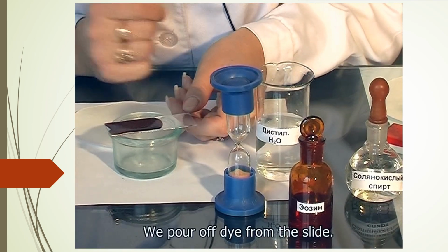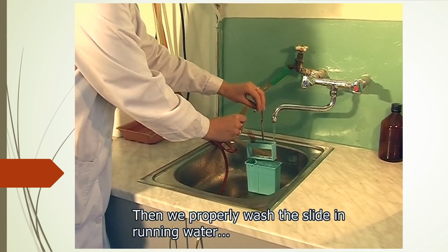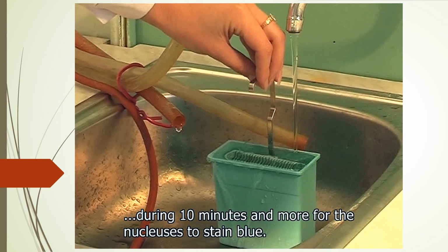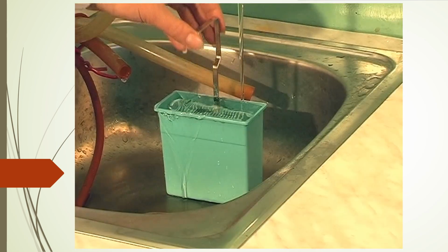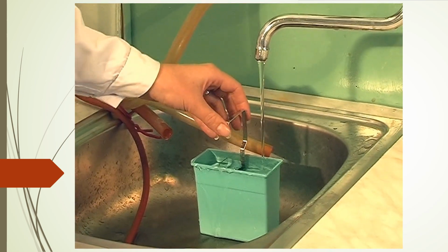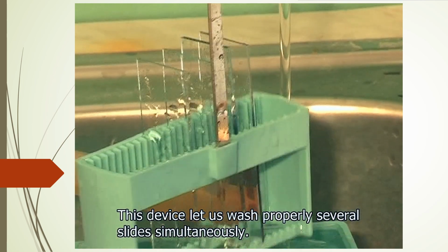We pour off dye from the slide. Then we properly wash the slide in running water during 10 minutes and more for the nucleuses to stain blue or purple. This device lets us wash properly several slides simultaneously.